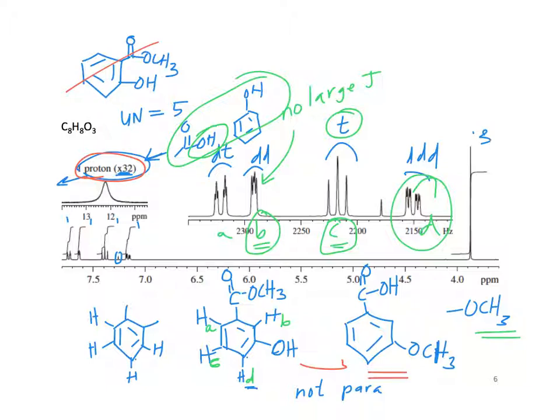But what I did, not that this really solves the issue, is that I went into this prediction website where I showed you guys the couplings last time. It's called NMR DB or something like that. I think I had it written on there last time. Tatiana in our group uses that website.